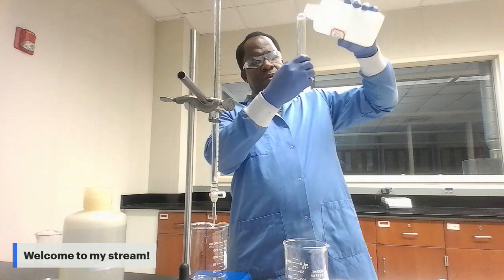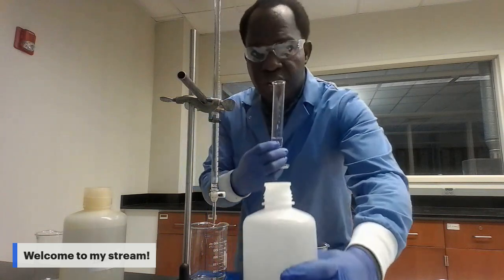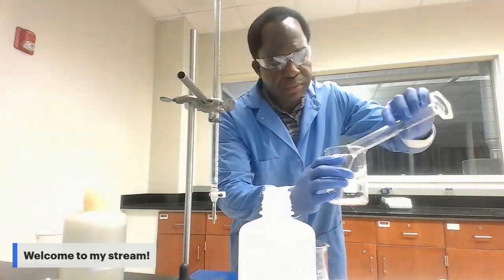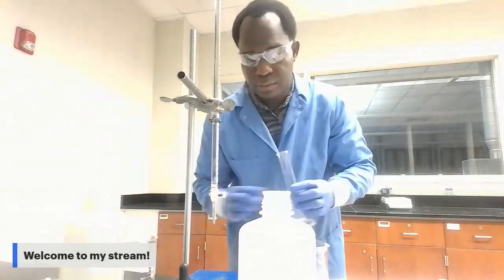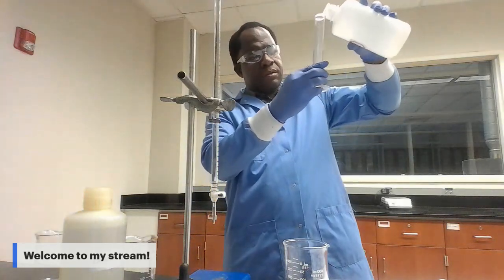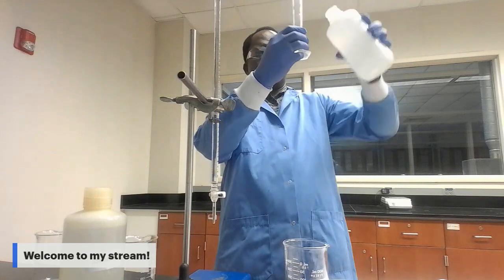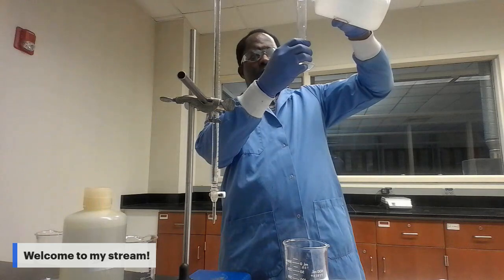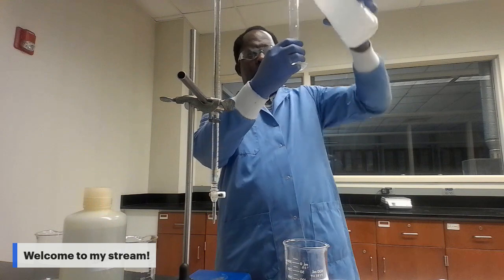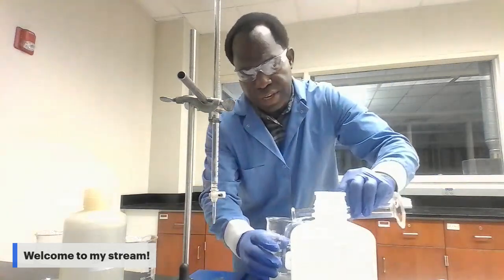So I have my 20 milliliters. I'm going to pour it into my first beaker. Get another 20 milliliters, pour it into my second beaker.